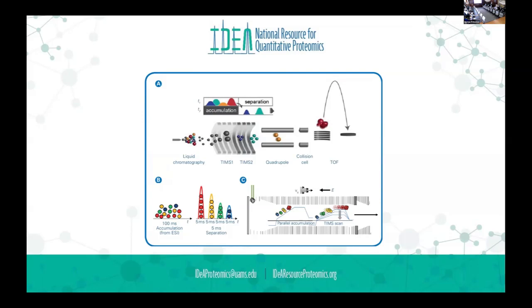And the mobility cell is pretty robust. If anything, I think it could benefit from a higher capacity cell, which I guess is what the HT is. And it may be why Andy's experience with these is maybe not like ours. It seems to be pretty robust in their lab, and ours, not so much. We have the previous version, TIMS Pro 2. But I think ion mobility coupled with DIA makes sense. Hopefully we can see it on an Astral sometime other than in the FAIMS variety.